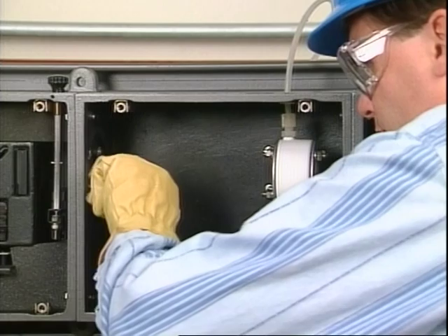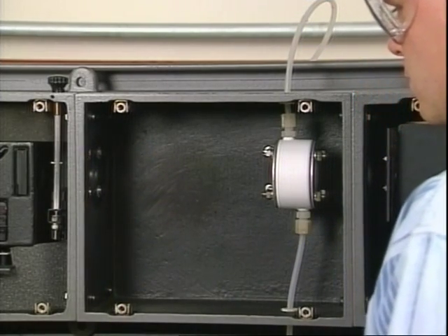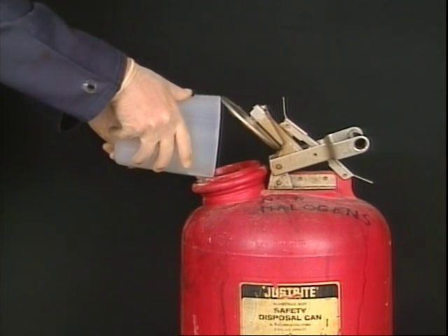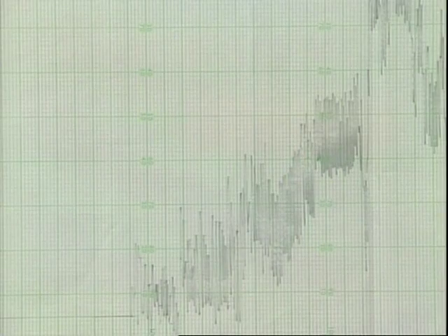Avoid using abrasive cleaning solutions and materials on cell windows, lenses, or mirrors, and be certain that other analyzer elements will not be damaged by the cleaning solution. All used cleaning materials, solvents, and empty containers should be disposed of according to government regulations and your facility's specifications.